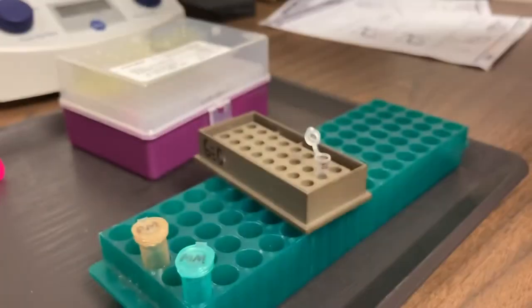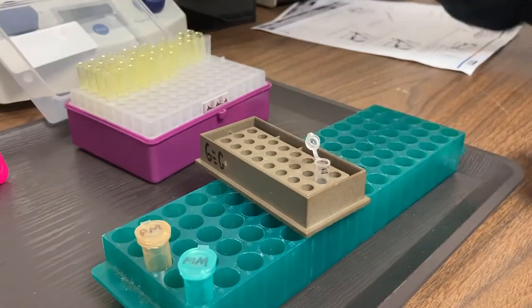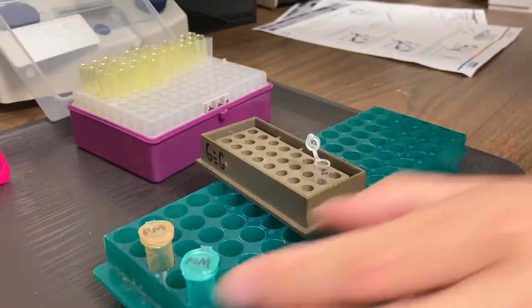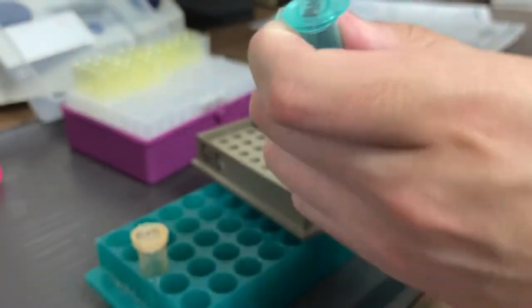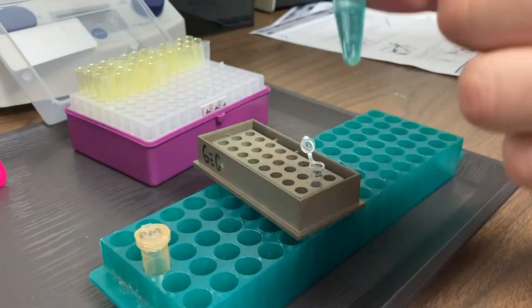Next, we'll set up our PCR reactions. First, we'll set the volume of our micropipet to 20 microliters, and we'll add our master mix to our PCR tubes.